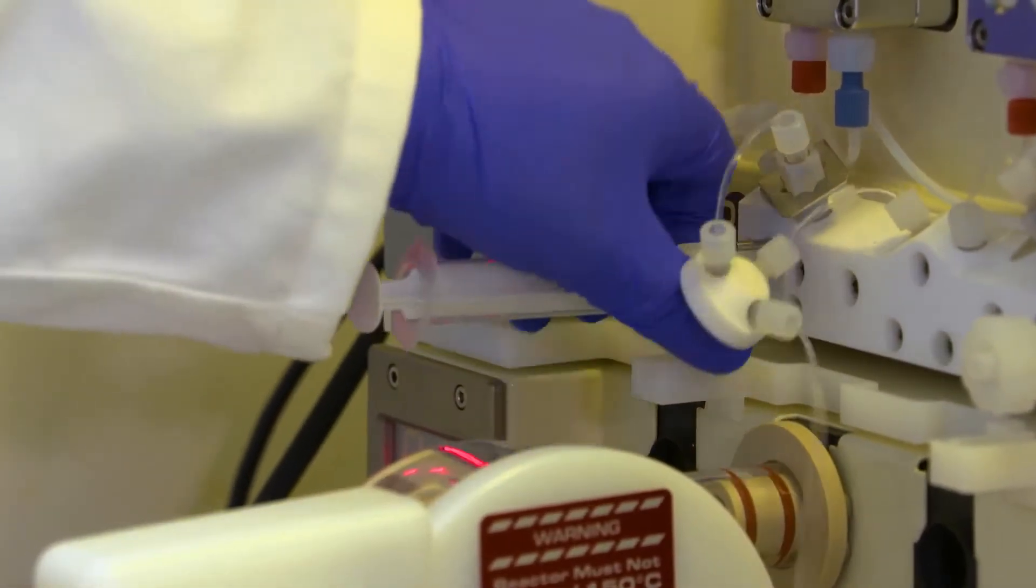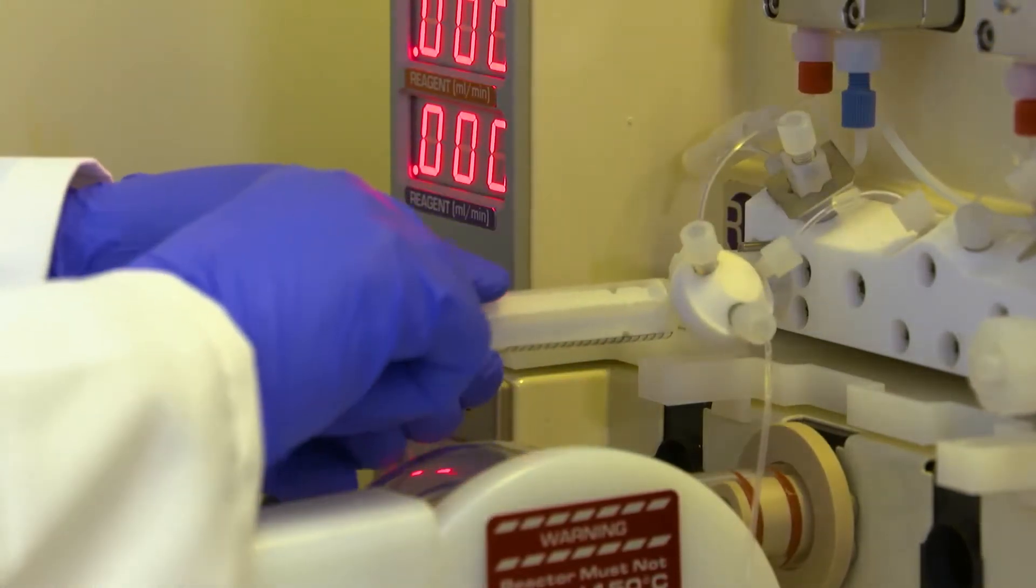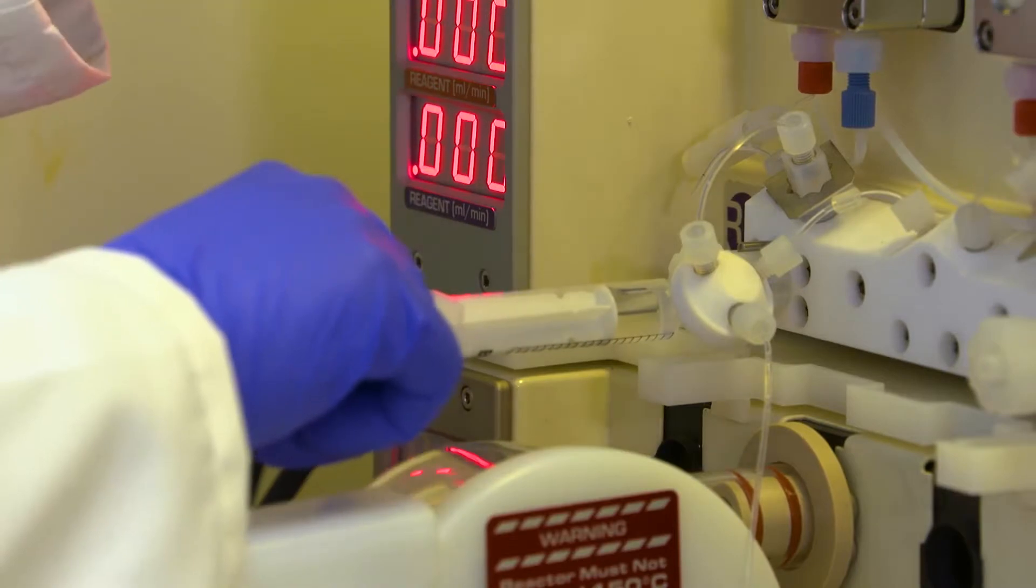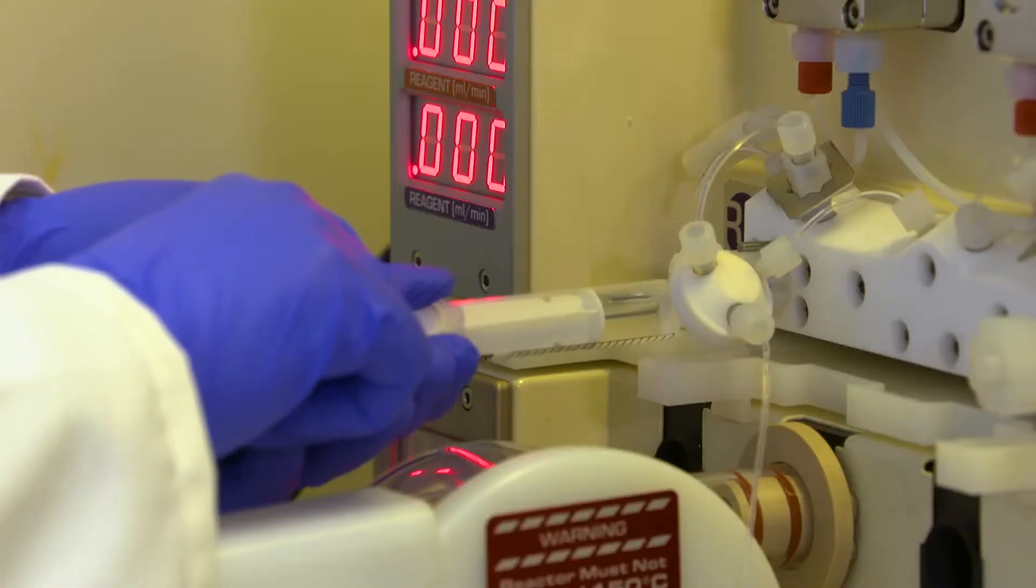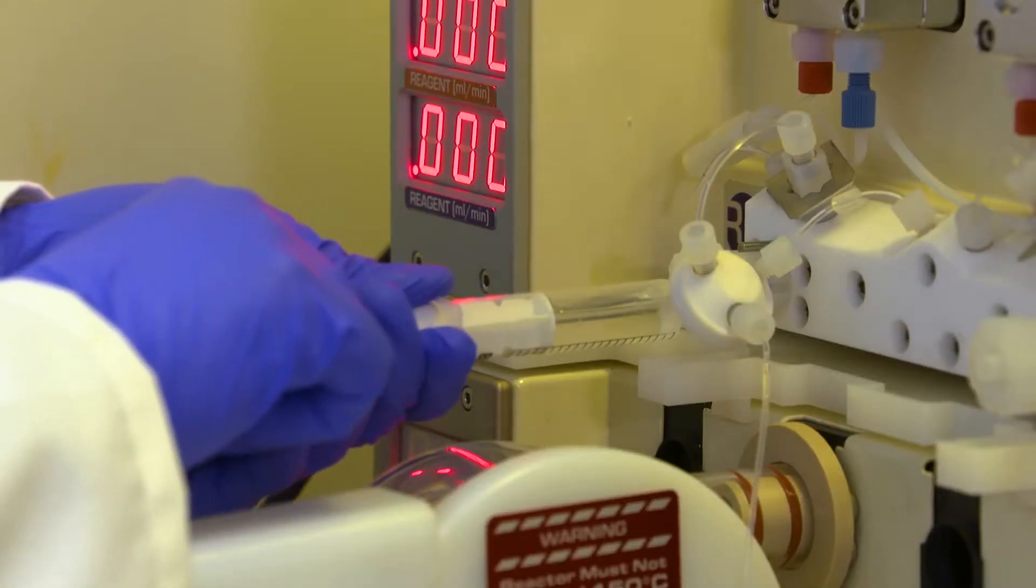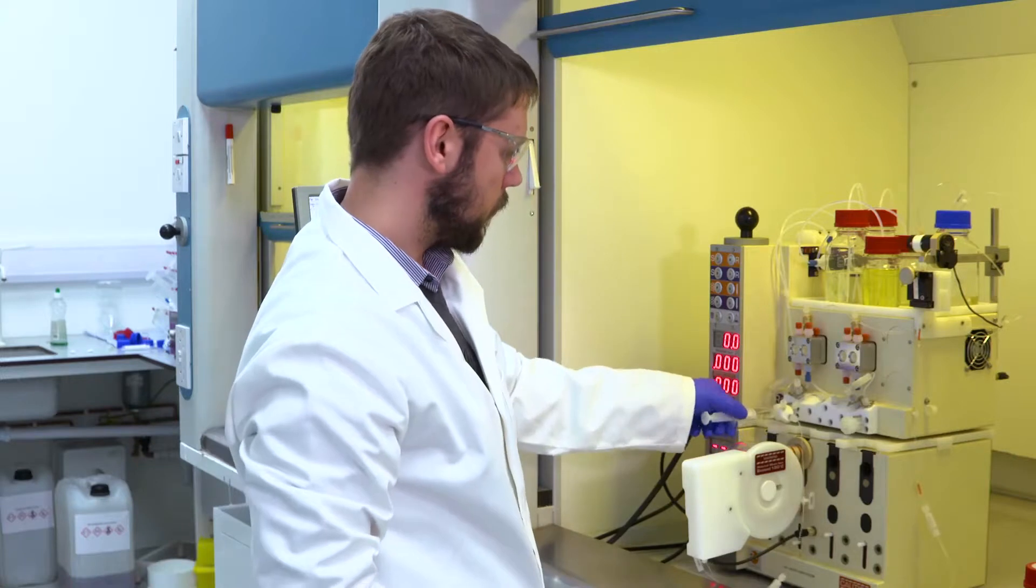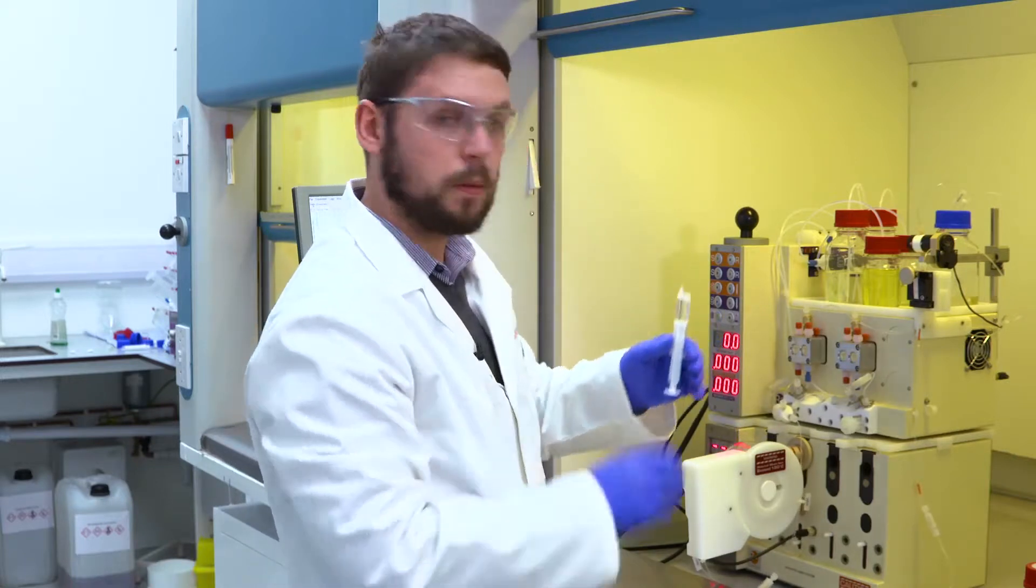Then using a syringe I open the priming valve about one full turn. Pull through a few milliliters. Switch back to solvent. Pull through another couple of milliliters. Close the valve just finger tight. And you can dispose of this.